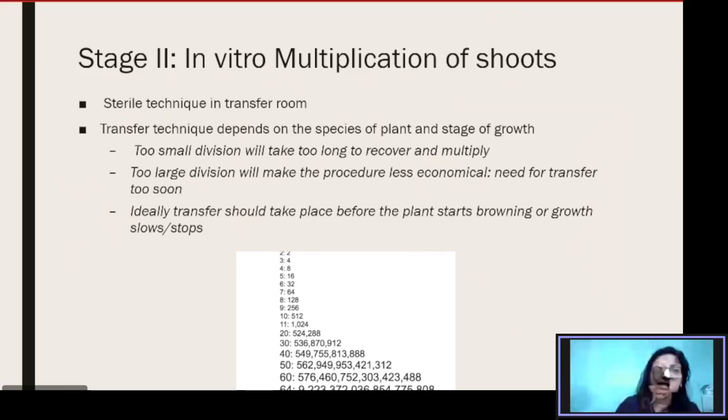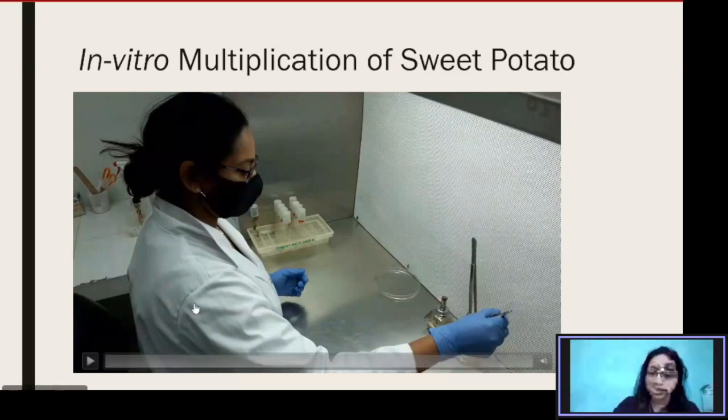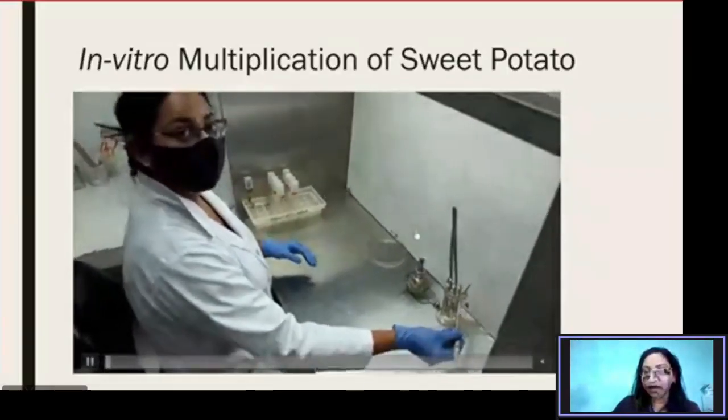So I just want to move on to another video on in vitro multiplication of sweet potato. This is just to demonstrate the technique for multiplication. So this is me in the laminar flow hood.